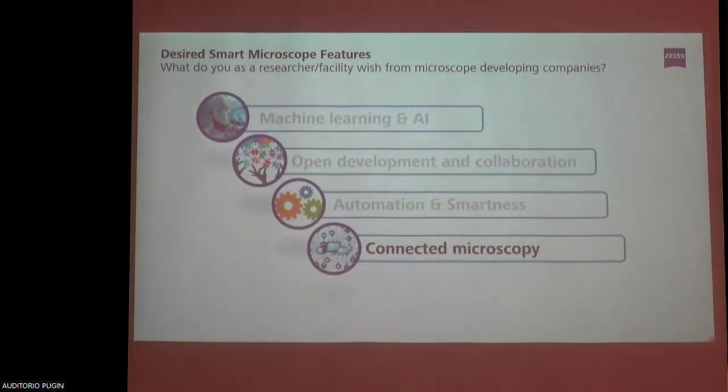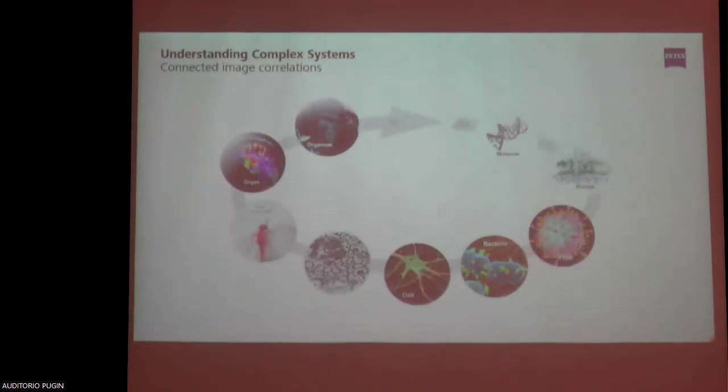Okay, the other big topic that is also important to consider in the field of microscopy evolution is connected microscopy. And what do I mean with connected microscopy? I told you already that nowadays it's not only enough to take some pictures and publish it, but also to prove your findings with different technologies. But what is also important is to put it in some context.